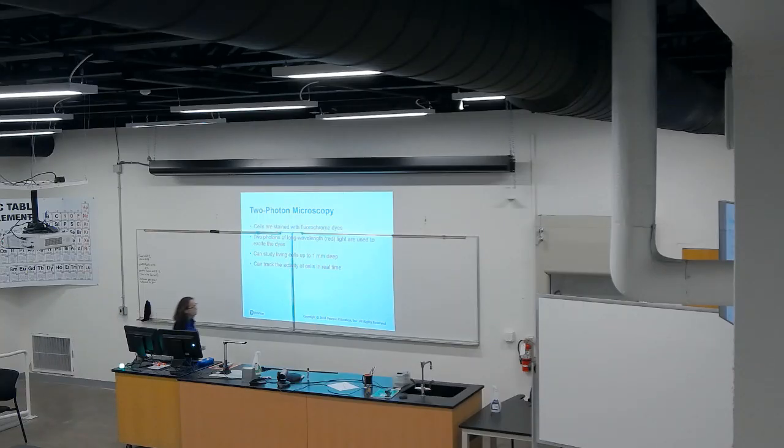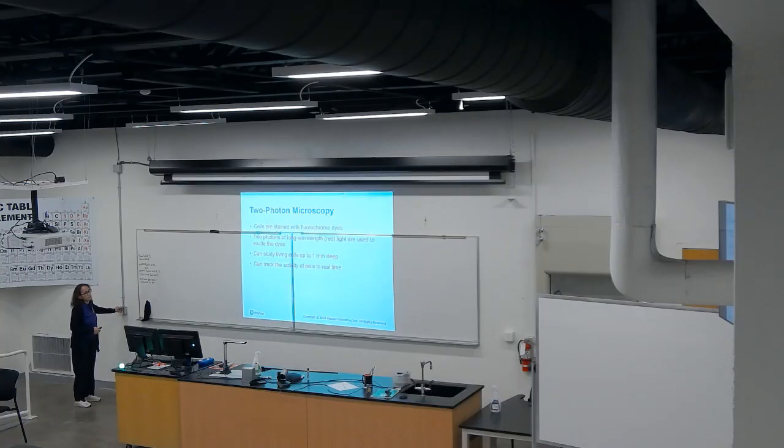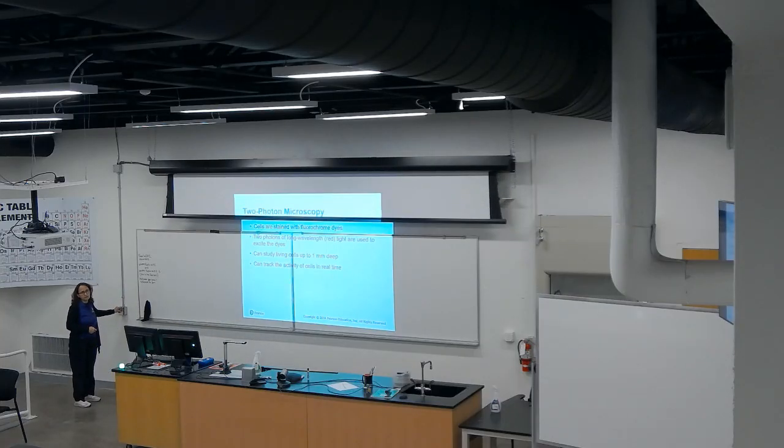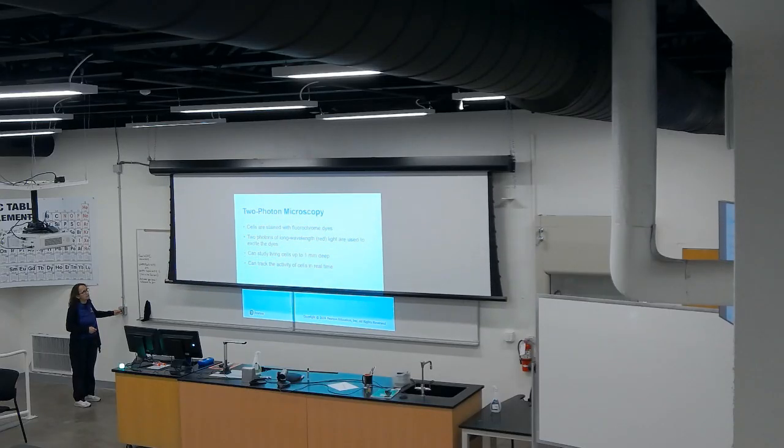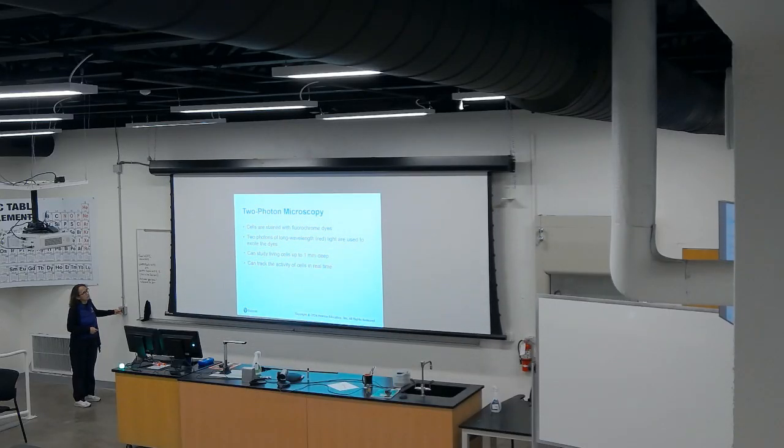So now, let me bring this down. Let me see here. For two-photon microscopy, it uses two wavelengths of light, or photons.